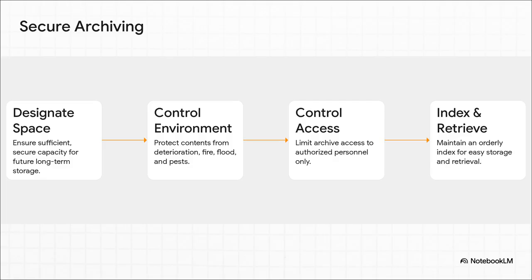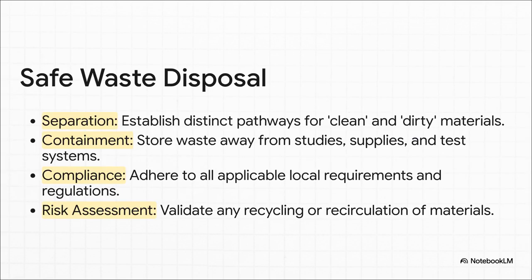So what's the key takeaway here? A GLP-compliant archive is not just a dusty storeroom. It's a controlled vault. As you can see from these steps, physical security is data security. They're one and the same. When it comes to waste disposal, it's all about protecting the integrity of what's happening in the lab right now. The whole goal is to completely eliminate any chance that waste materials could circle back and contaminate ongoing work.